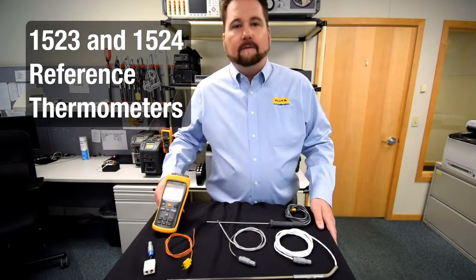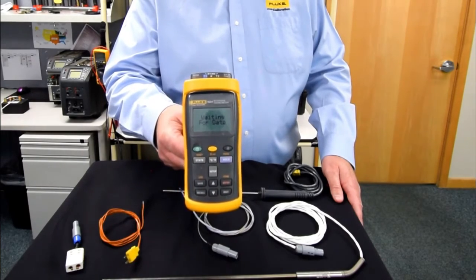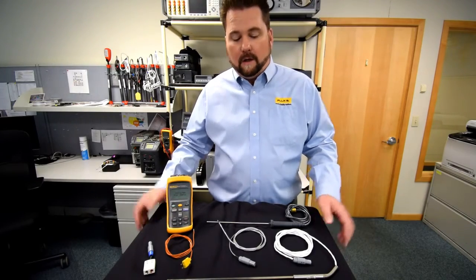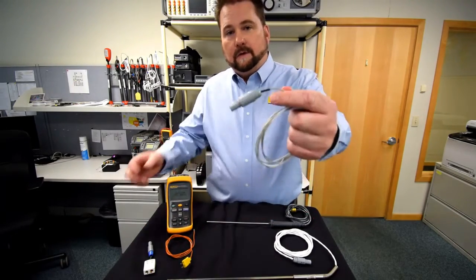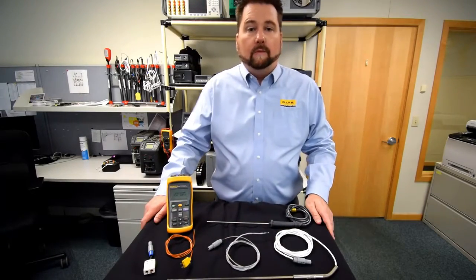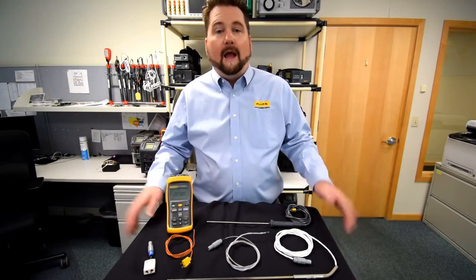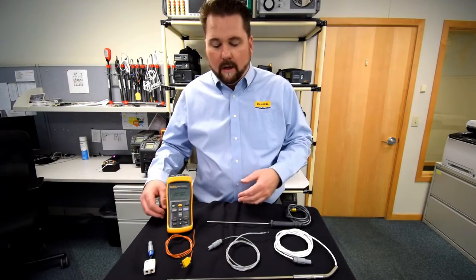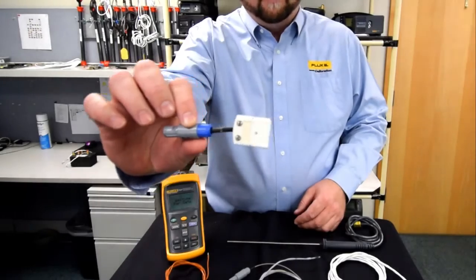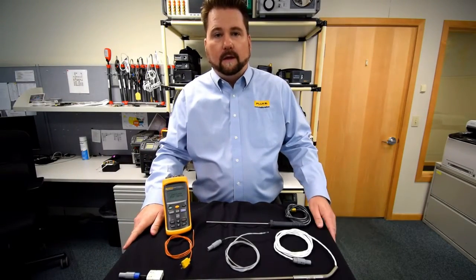I've actually got the 1524 here, but we do have a 1523 which is a single channel — this is our dual channel unit. The great thing about these units is they utilize our Infocon connector technology, which allows for quick plug-and-play between multiple probes. This lets a user move between multiple applications without having to stop, reprogram, or enter coefficients. You can also get our universal TC adapter, which you can program for multiple types of thermocouples throughout the base metal TC range.